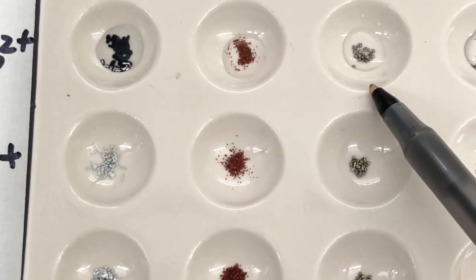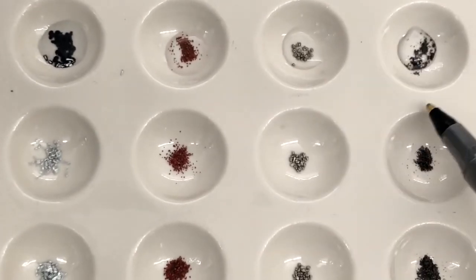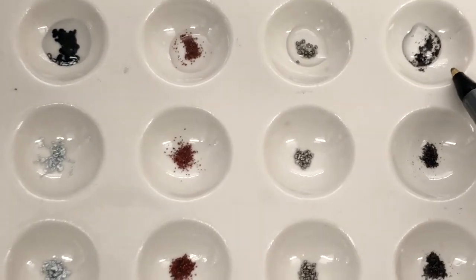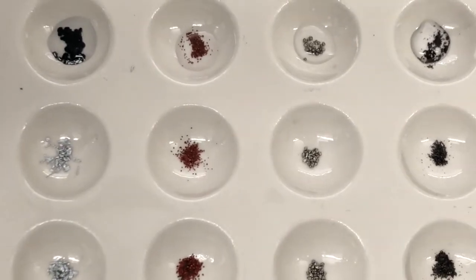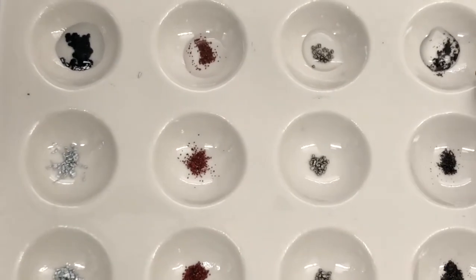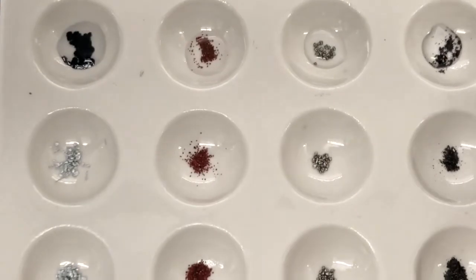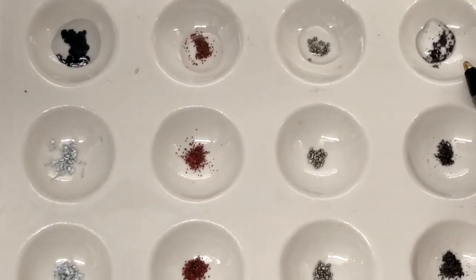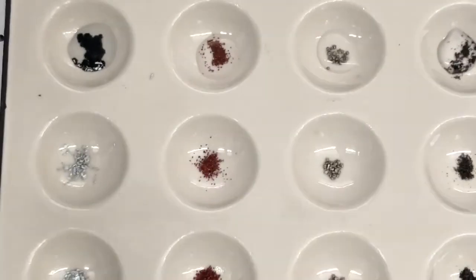When we look at the tin, we're not seeing much of a reaction initially. And then when it comes to the iron, again, the iron particulates are a little bit more difficult to see, but my initial instinct is to say there's no reaction there. We will again go back to it later on and see if we see any changes over time. But certainly of the four, the zinc is the most reactive.